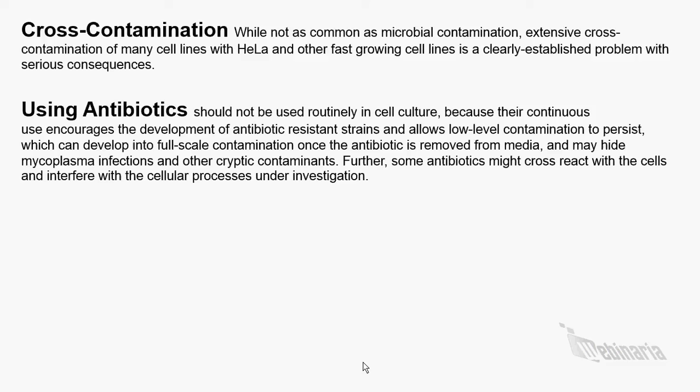HeLa is one of the most famous cell lines and one of the oldest. Okay, and there are many cases where HeLa has contaminated other cell lines. So generally people believe, okay, but when you are doing very sophisticated work, you need to identify your cell lines, and there are several methods to do that. So don't just believe whatever you have been given.